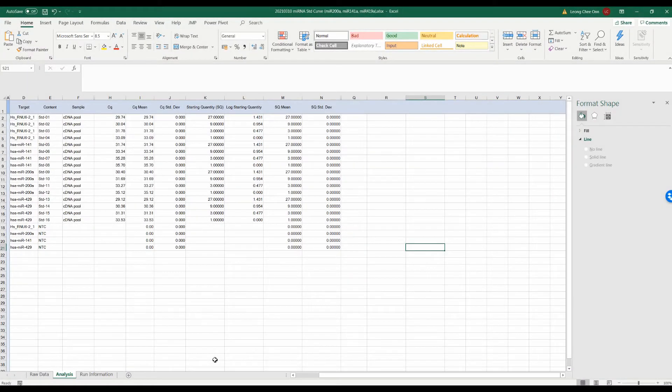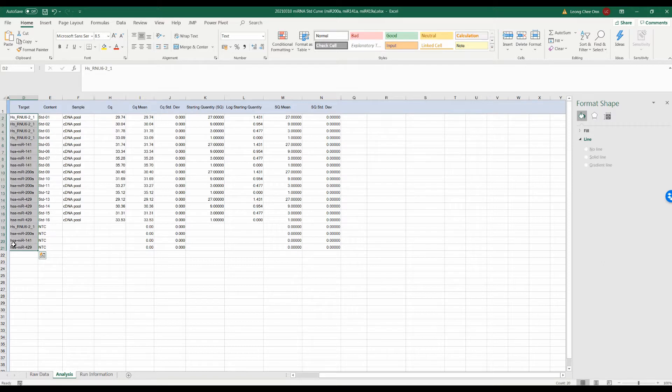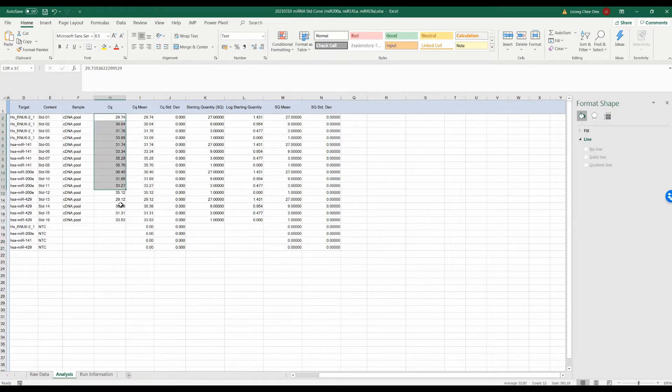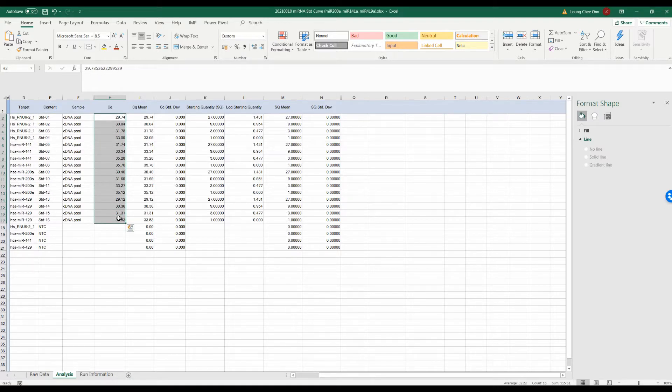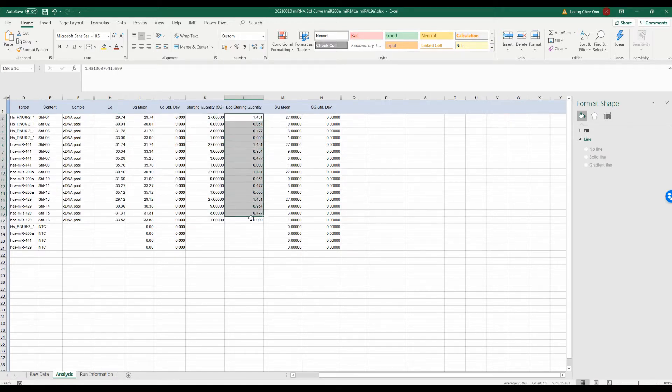Once the qPCR is completed, we can export the data file and open it in Excel. Here, you can see the target that is being amplified. It is a good practice to include the code for each primer pair if there are more than one pair of primer being used for a target gene. You also see the CQ which represents the threshold cycle determined by the machine, and SQ representing the starting quantity which was keyed in based on our dilution factor.